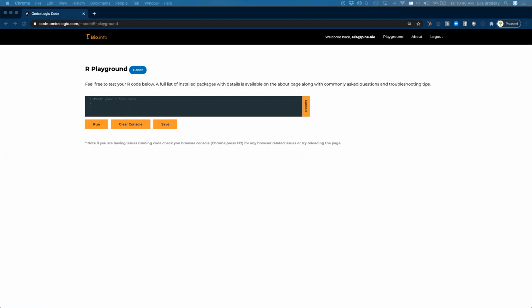Okay, so first of all, what we want to do in R, it's not really complicated for those of you that are not familiar. Obviously, for those of you that are familiar, it's going to be even simpler, but I'll show you where to find some additional tutorials to get this started and eventually onto your computer. Okay, so first of all, we need to have a library that is going to be using the Excel sheet that we have.